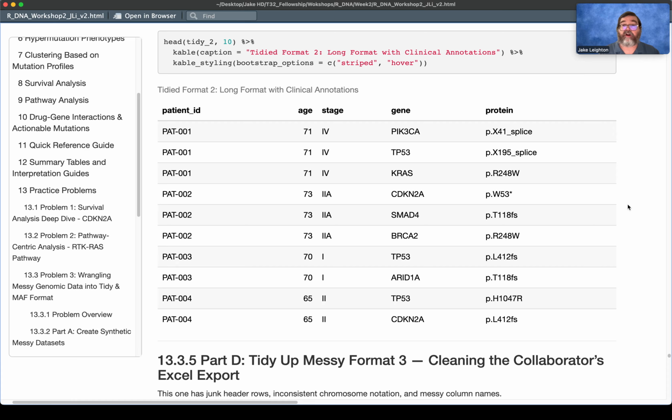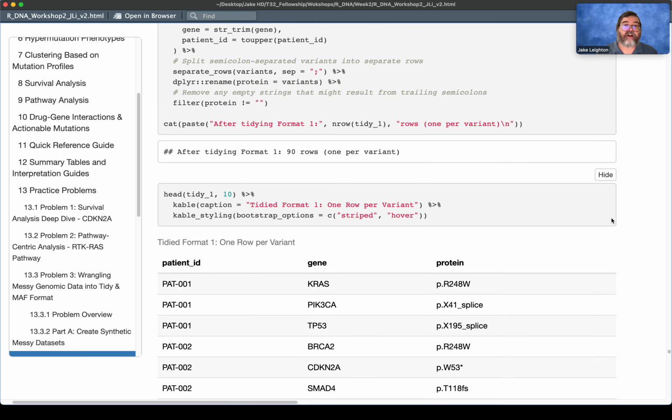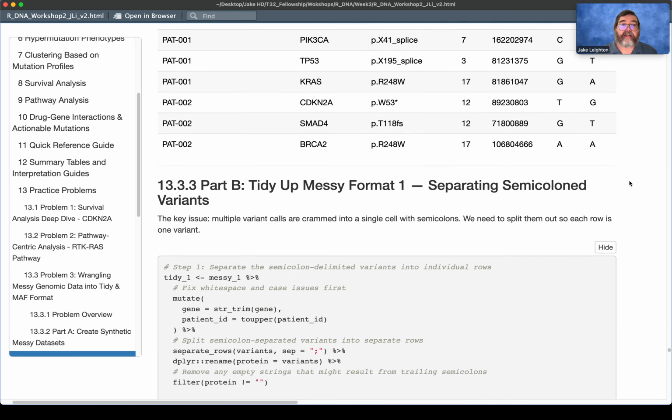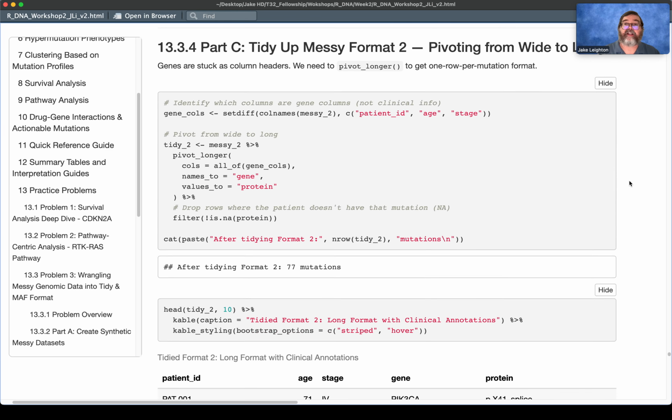All the NAs are out. And you see, for instance, for patient number 1, you have these 3 types of mutations. So that's much, much cleaner than what we saw earlier, where patient number 1 had all the NAs, nonsense, extra rows, things like that. And now we can put that into our next step.